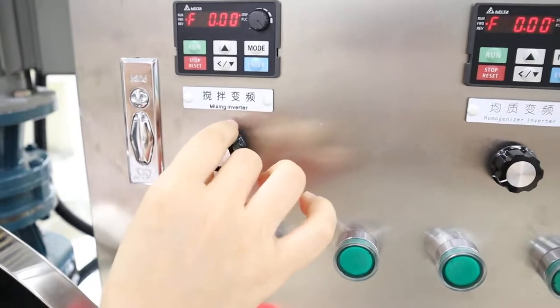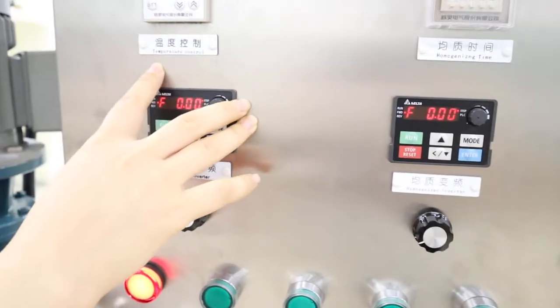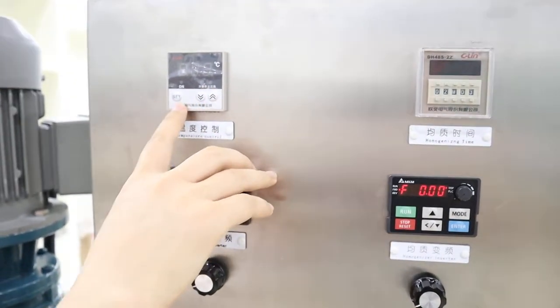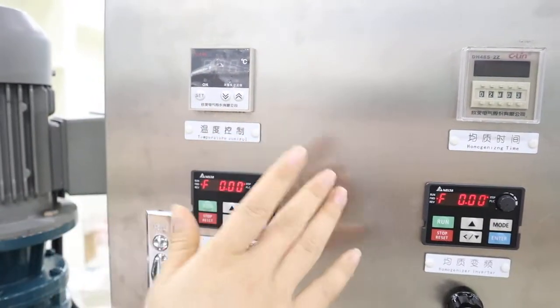For this conversion, just change this way and it's okay. Here is the temperature control. You can set the numbers here and it will stop when it arrives at the set temperature.